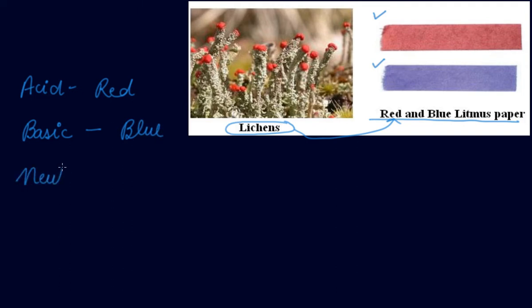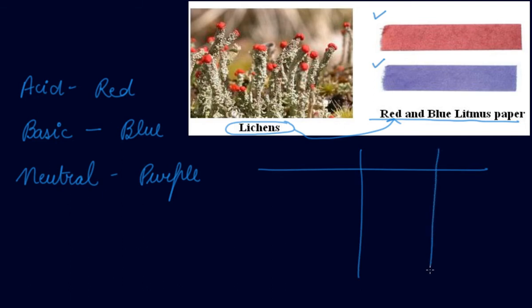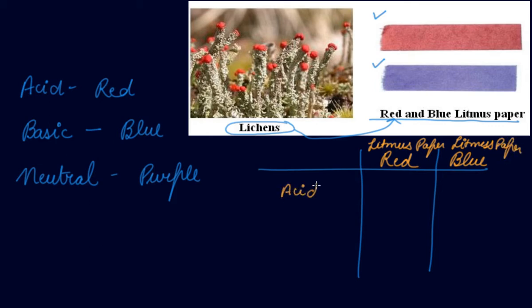In a neutral solution, litmus turns purple. You have two types of litmus paper: red color litmus paper and blue color litmus paper. There are three types of substances to check: acid, base, or whether they are a salt, which is neutral.